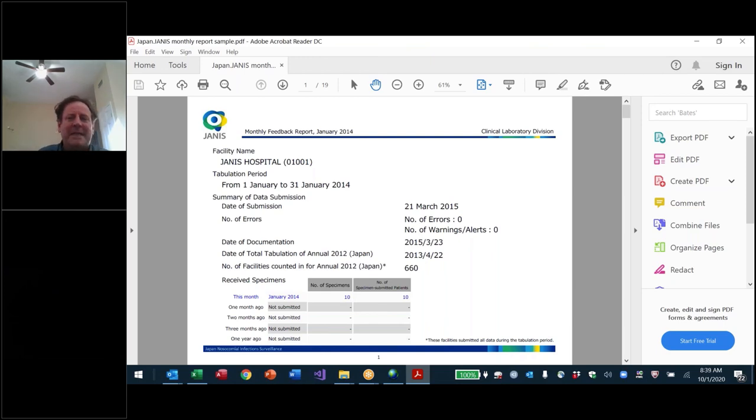On the one hand, I want representative data, but more important than representative data is reliable microbiology. There's no sense in having representative data if you don't trust that the laboratory knows what they're doing. So what they did is they started with the 9 excellent facilities, worked with them to improve them over the years. So those 9 facilities are basically doing an ongoing special protocol, small data volume, a lot of patient details. But for their ongoing national program involving 40 laboratories, they're simplifying it to what is practical and routine.